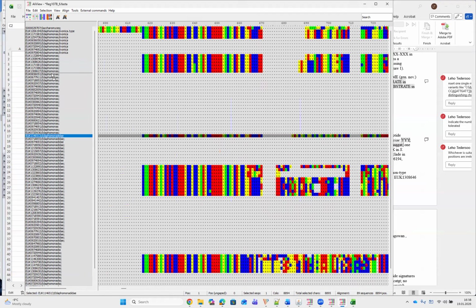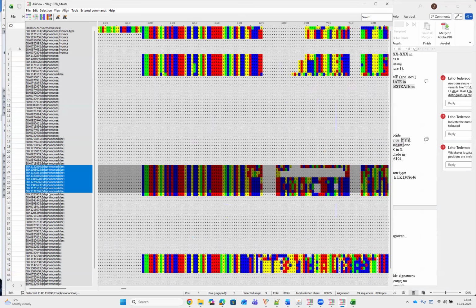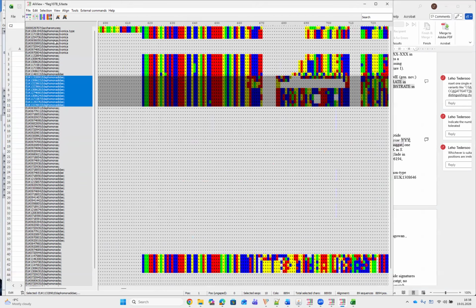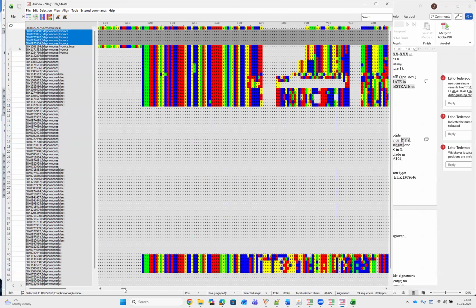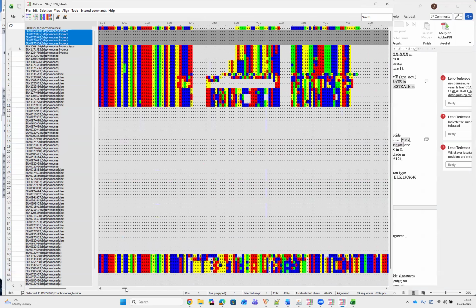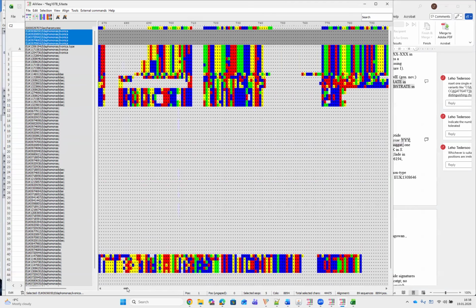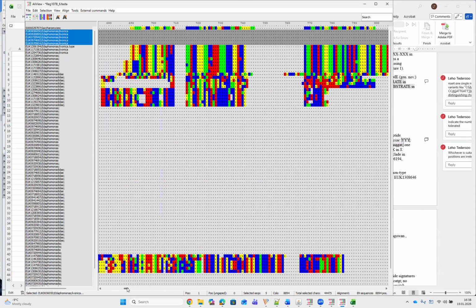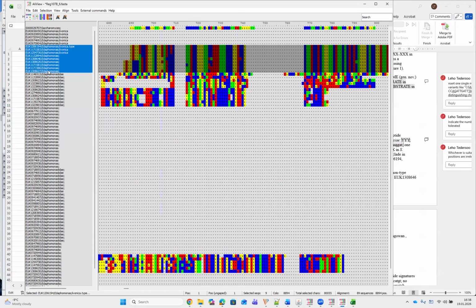What we can do here again is to take members of the same genus up for a closer comparison. So we have to distinguish these from those below.